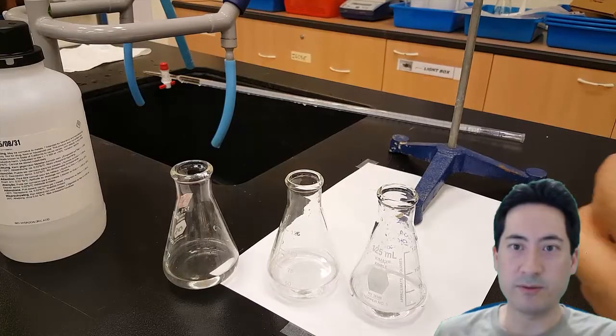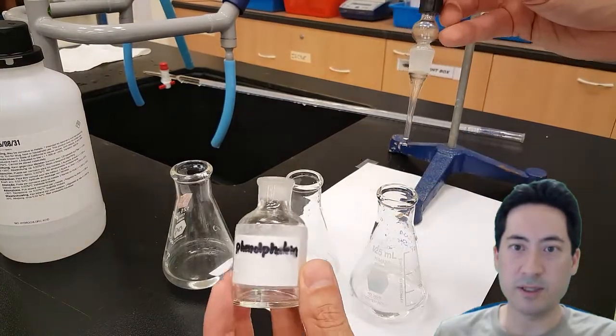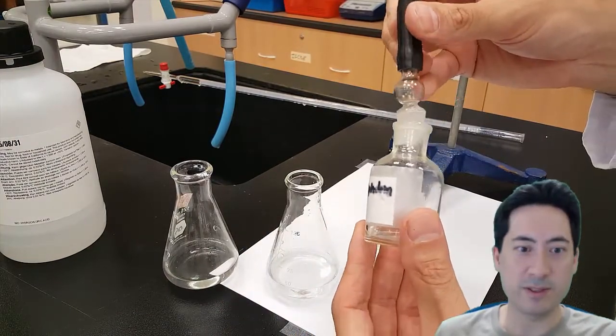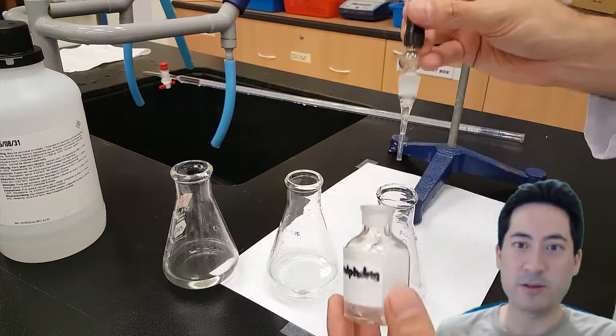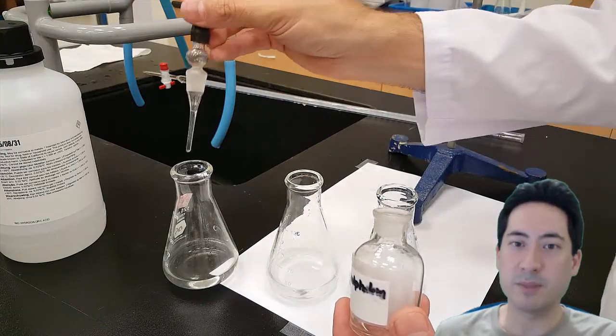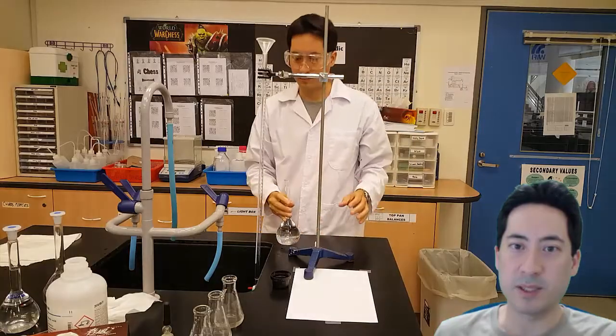So I've added 3 drops of phenolphthalein to each of these conical flasks. Don't forget to do that, it's quite painful when I see students do that. That's to make sure the solution goes pink once it's been neutralised and starts to become basic.